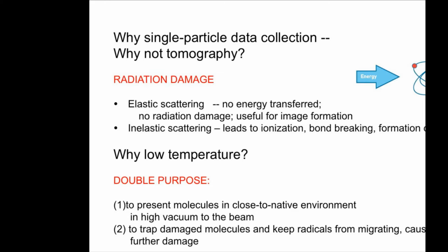Now the image formation, this diagram here is up here. Now the lens intercepts these rays, and the lens is supposed to reconverge all the beams that come from a single point into a single point again. Now you can see with any instrument like the electron microscope, this is not going to be ideal. We don't get a single point back because of wave aberrations. So instead of a single point, we get an extended point.